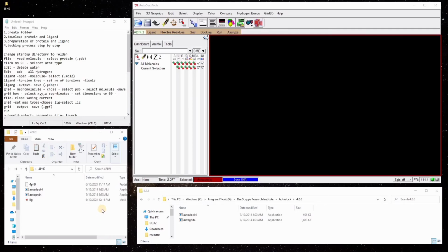Hi friends, in this video I'm going to show you how to perform molecular docking using Autodock tools. For this, first we need to create a folder, then download protein and ligand molecules, and then prepare the protein and ligand, and do the docking process step by step.